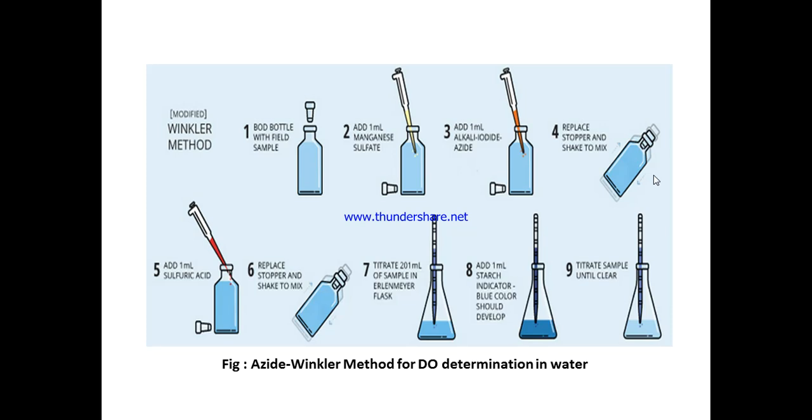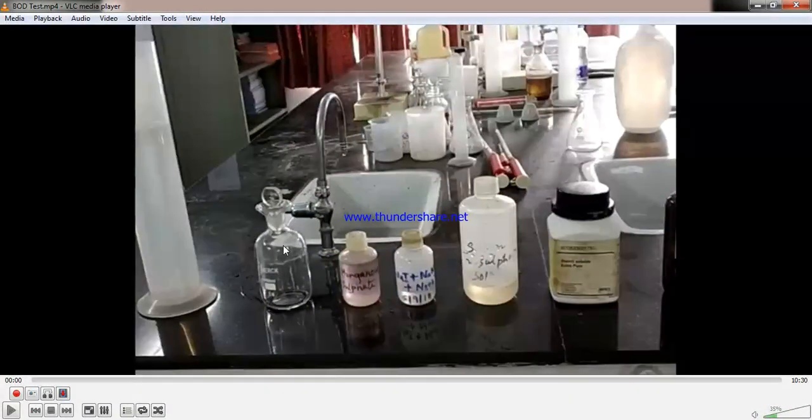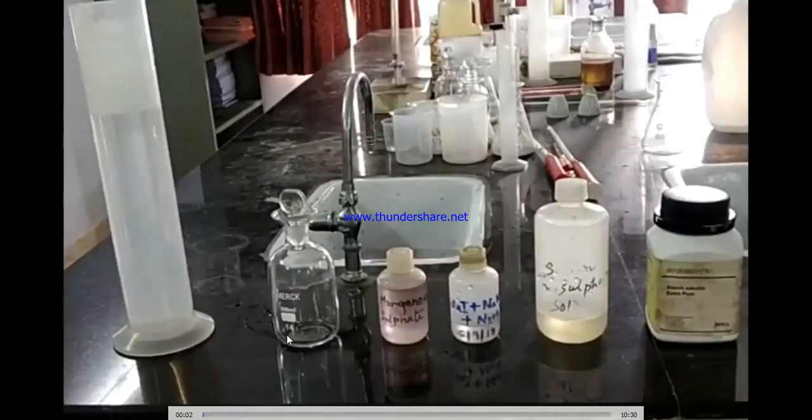As simple as that. Now I'll show you the lab video that we have prepared for the purpose. Here you see the water sample. This is the BOD bottle, students. This is the 300 ml BOD bottle.